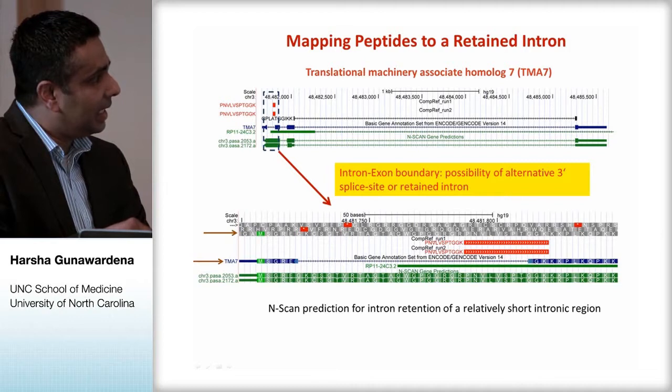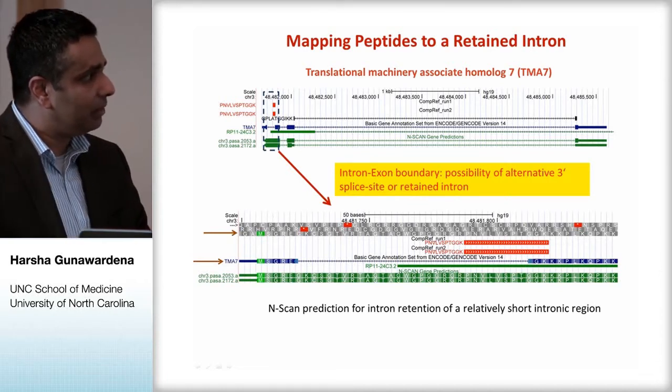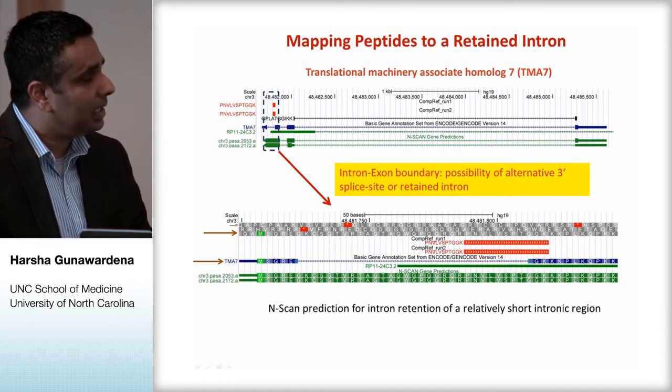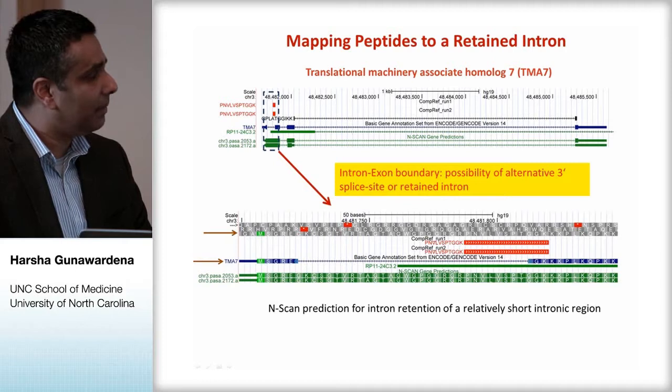And we see that there is a new start site for this over here, which corresponds to the start of this gene here. And if you take a look at the amino acid sequence, we see that it could very well have been that there would have been a lysine over here, which resulted in the cleavage of this whole piece out. So we didn't observe the entire piece because of the wrong enzyme. So we use trypsin in this case.